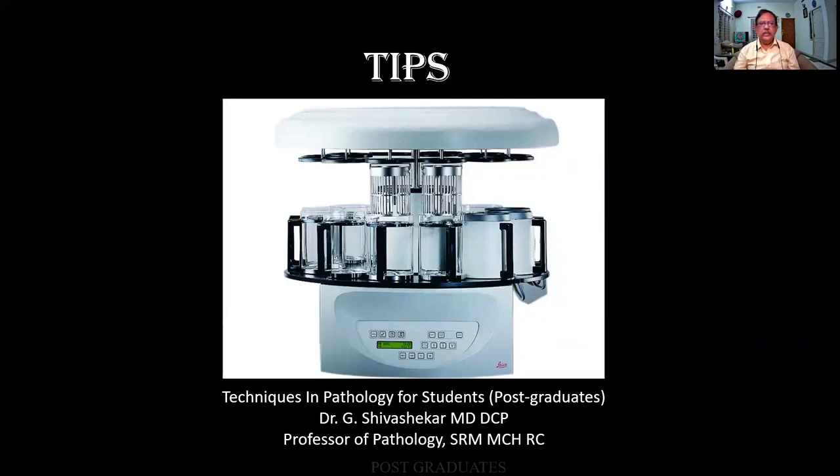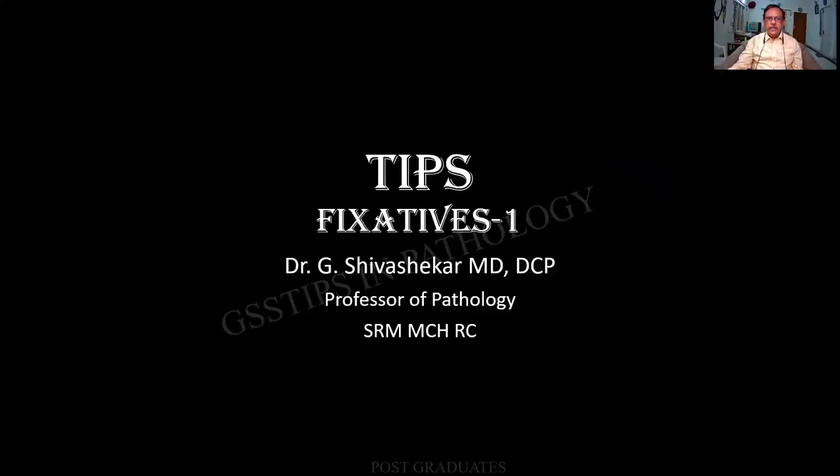Dear students, welcome to TIPS, Techniques in Pathology for Students, mainly intended for postgraduates. The topic for the day is fixatives. I have intentionally divided this into two parts, and this will be fixatives part 1.